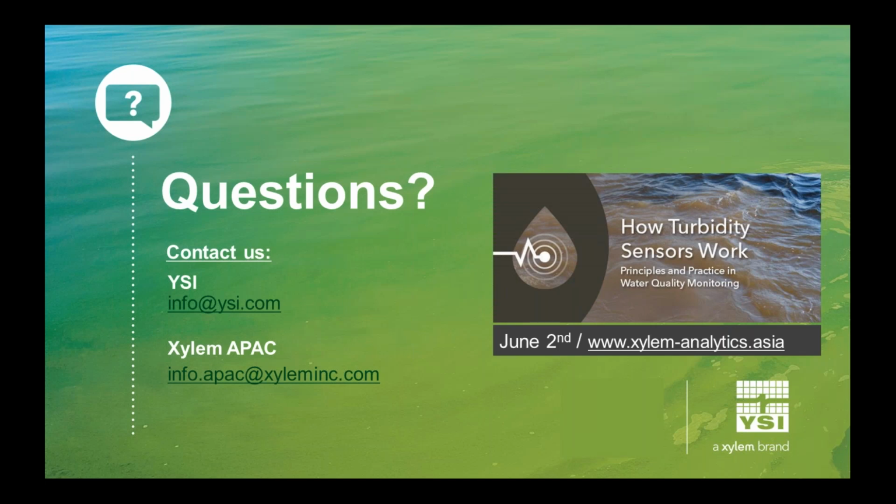But let's go back to that example that I just talked about, where they were doing those offshore net pens. Those net pens were in a marine environment. And most people in a marine environment are going to use the total algae PE sensor because they're interested in blue-green algae that grow in the marine environment.